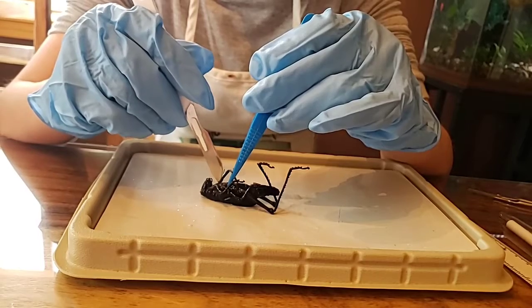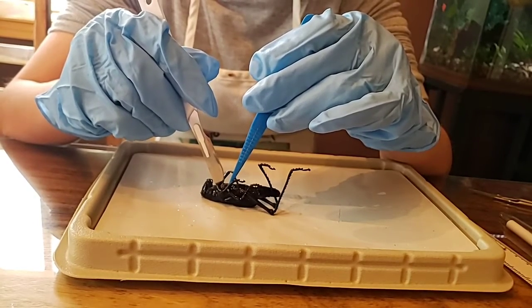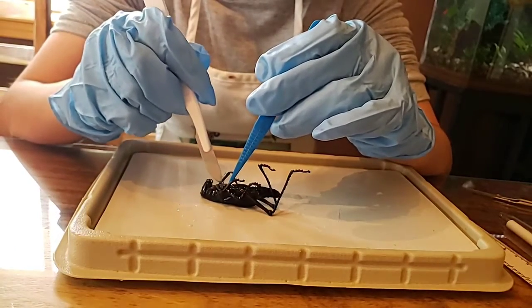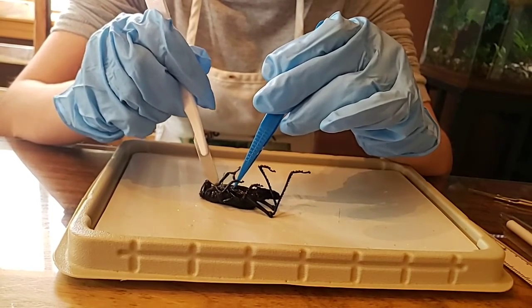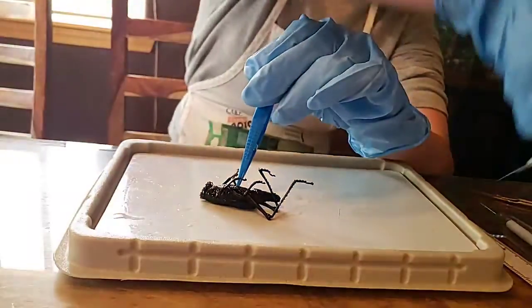I'm just gonna cut from the butt to the head. It's easier. It doesn't want to go in. Got to use a little pressure, because what does it have on the outside of its body? I've eaten one of these, sis. Tanley, what does it have on the outside of its body that makes it hard to cut into? Exoskeleton.